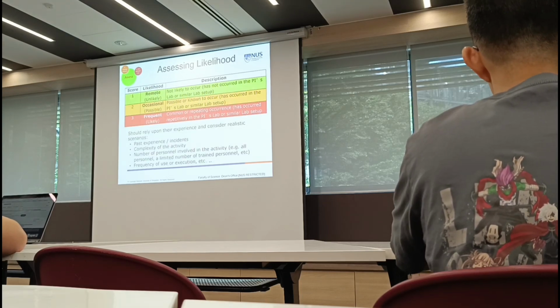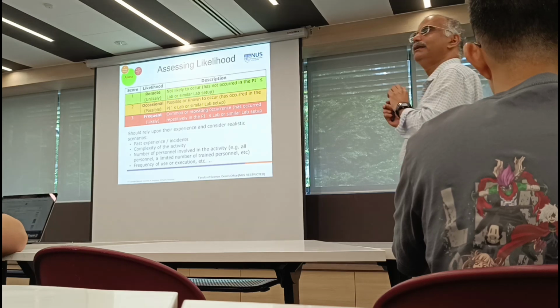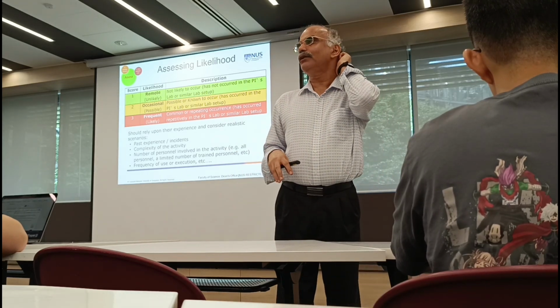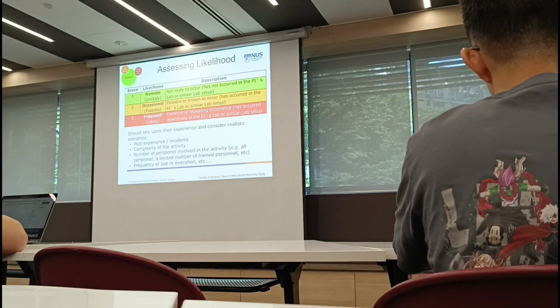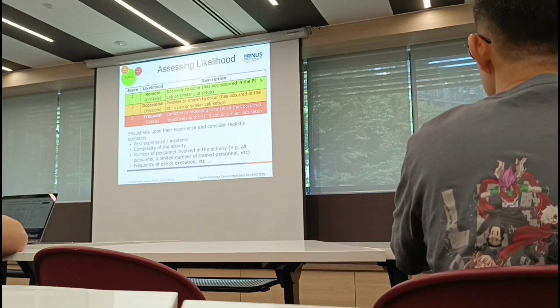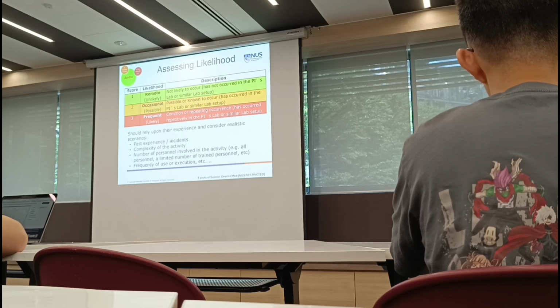So again, likelihood is remote. For example, as I mentioned just now, if you use a powdered 99% pure lithium aluminum hydride, it's guaranteed to catch flame because humidity in Singapore is very high. Now it's a little bit better because all labs are air conditioned. Ten years ago, some of the labs were not air conditioned, so you really had to open in the air, right? With air conditioning, the humidity goes down. Part of air conditioning is dehumidification of the air, so you have less moisture in the air, right?